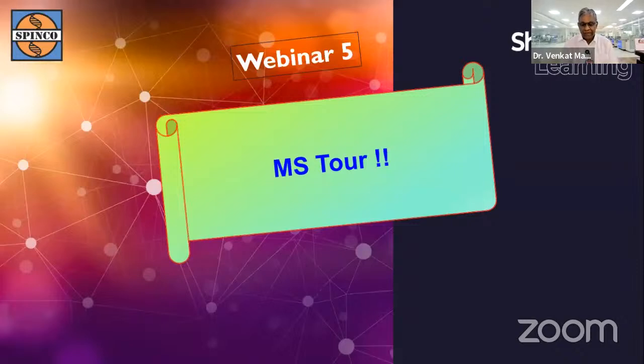Today, I am going to introduce you to mass spectrometry as a device or basically a detector to chromatographic techniques. Initially, in the last 4 seminars, when I was talking to you all about various aspects of HPLC, I also discussed the requirements of a detector. I discussed all kinds of detectors and I gave a small introduction to mass spectrometry.